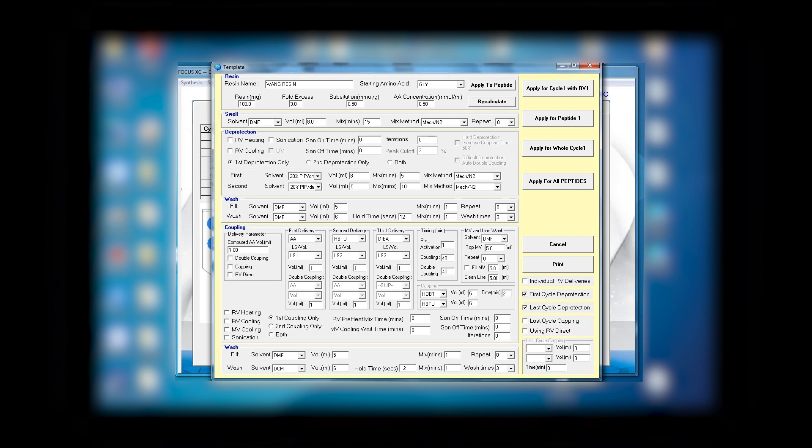Using 5 milliliter, which you could change to 8 milliliter if you like, and we're going to mix for two minutes rather than five minutes and using a different type of mixing. You see you have three modes of mixing: there is mechanical, nitrogen, and mechanical and nitrogen. In this example we're going to use only the mechanical.